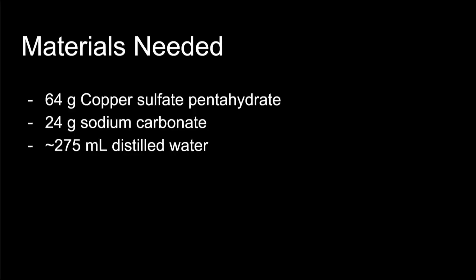For this preparation, 64 grams of copper sulfate pentahydrate is used as well as 24 grams of sodium carbonate and 275 milliliters of distilled water. The copper sulfate can typically be found at hardware stores as weed killer and the sodium carbonate was prepared in a previous video from baking soda. Sodium bicarbonate can be used instead, but a larger portion of carbon dioxide is produced resulting in a foaming issue.